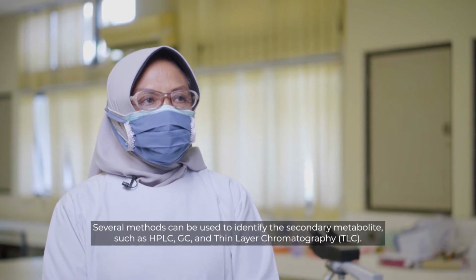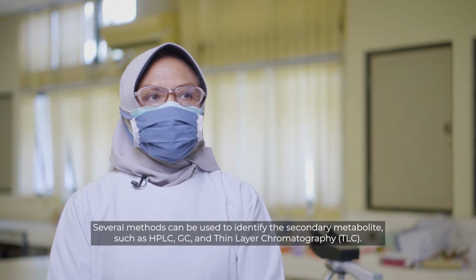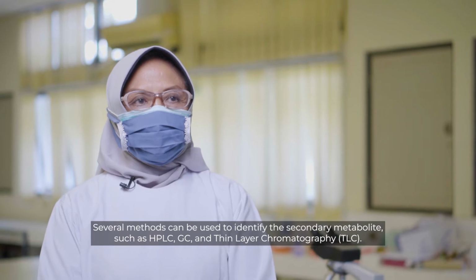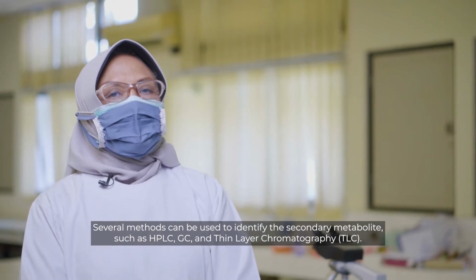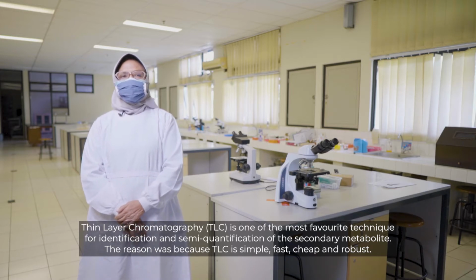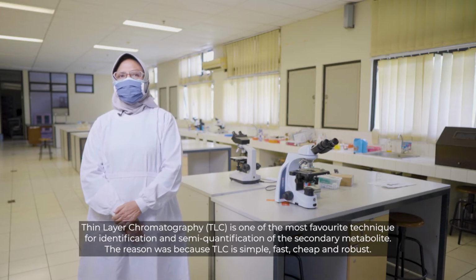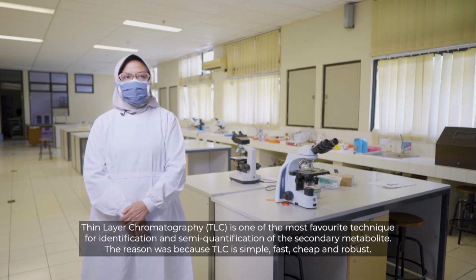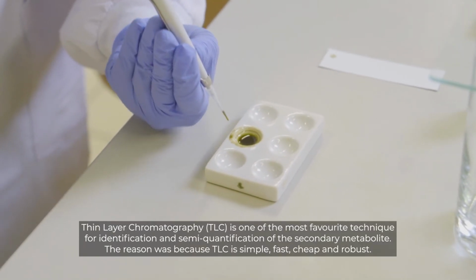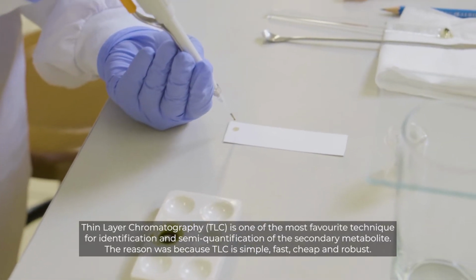Several methods can be used to identify secondary metabolites, such as HPLC, GC, and thin layer chromatography. Thin layer chromatography is one of the most favorite techniques in the identification and semi-quantification of secondary metabolites. The reason is that TLC is simple, fast, cheap, and also robust.